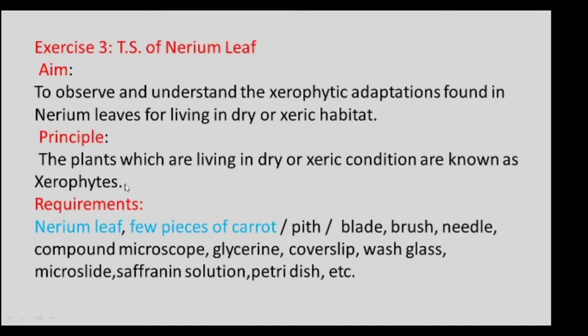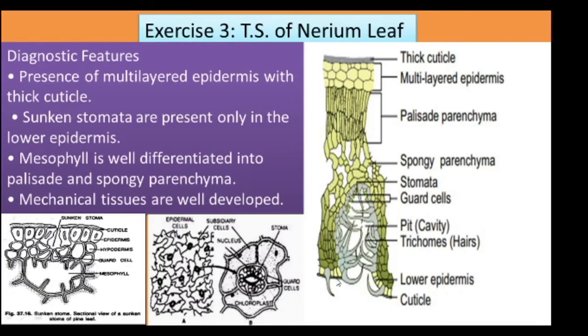The plants which are present in dry conditions are called xerophytes. Requirements: Nerium leaf, a few pieces of carrot, pith, blade, brush, needle, compound microscope, glycerin, cover slip, wash glass, microslide, safranin solution, petri dish, etc.